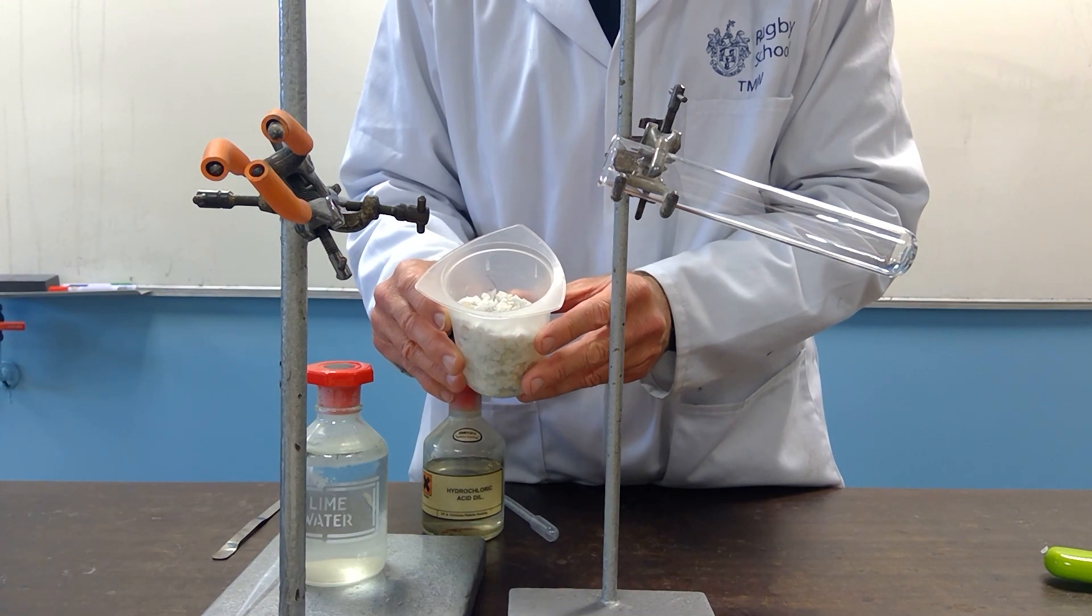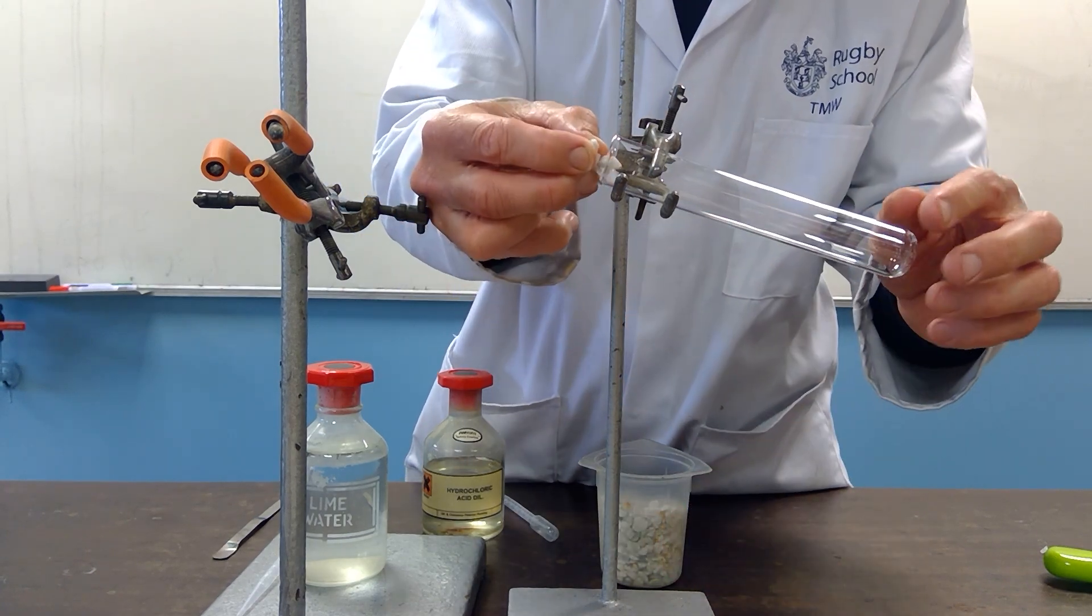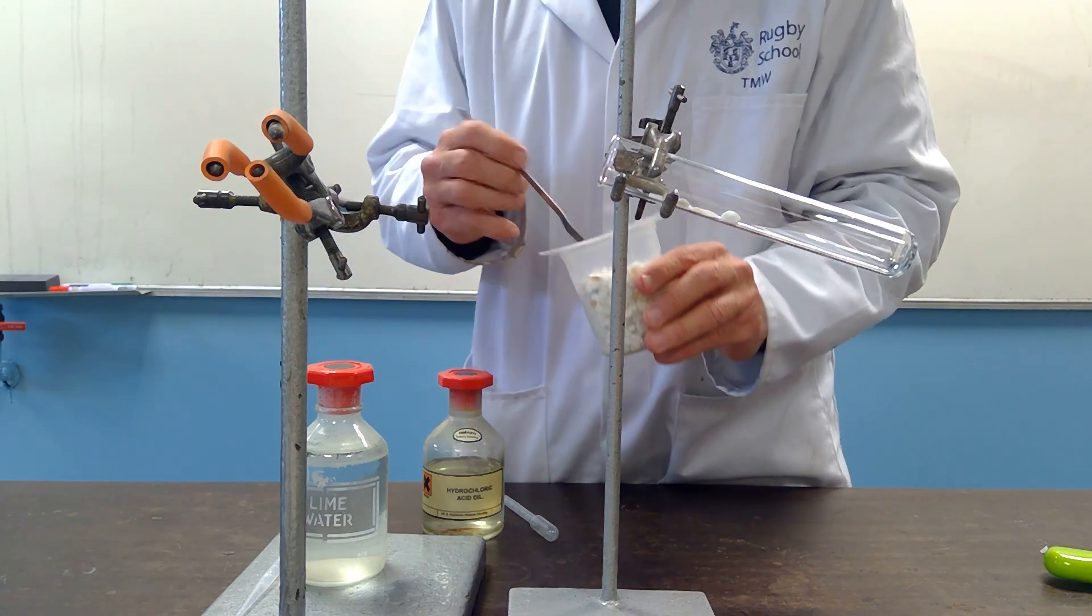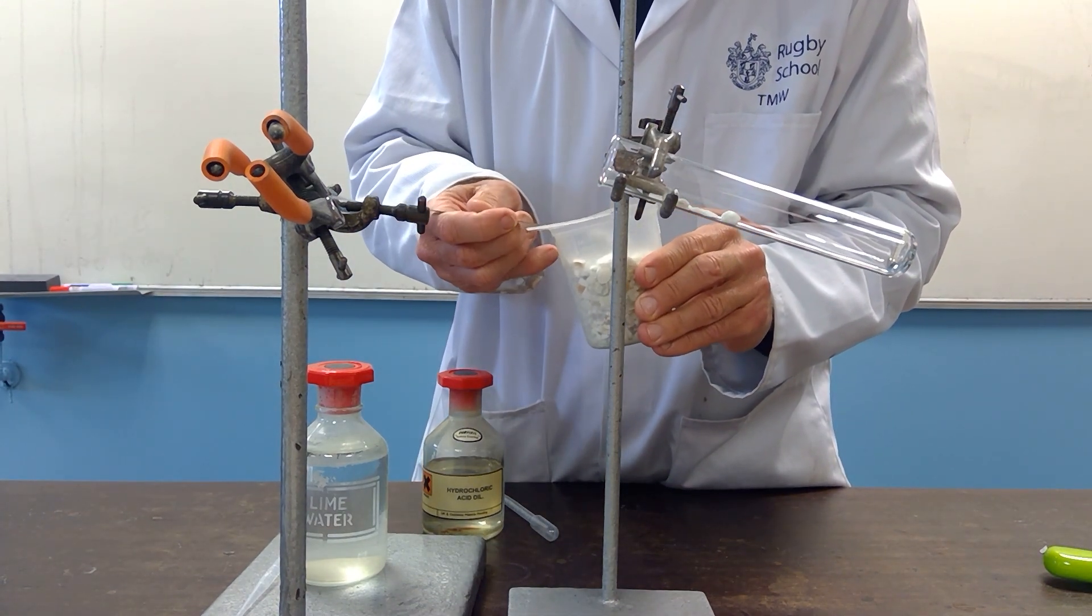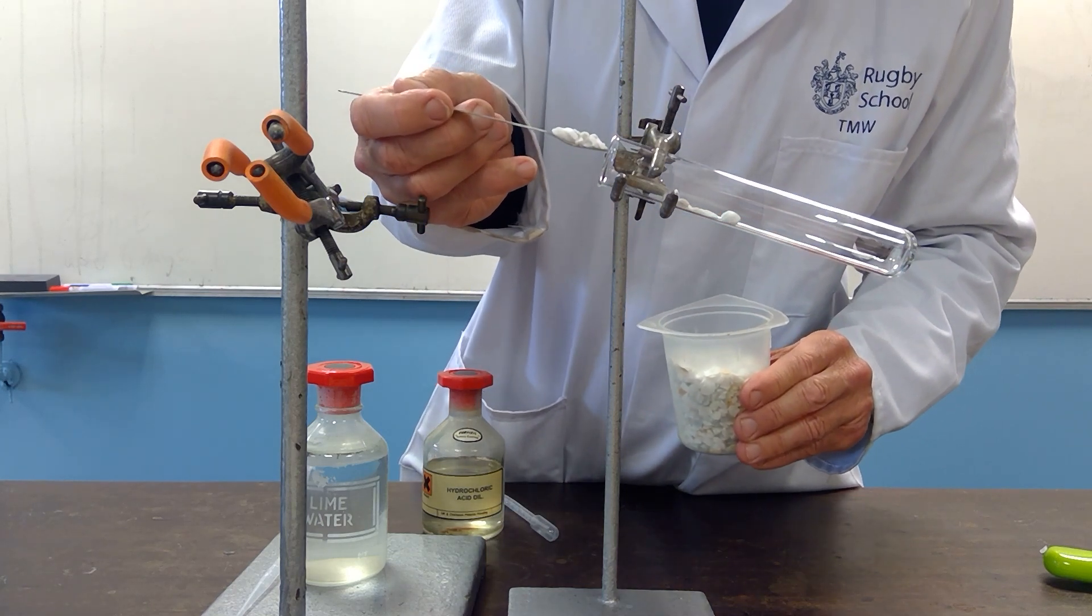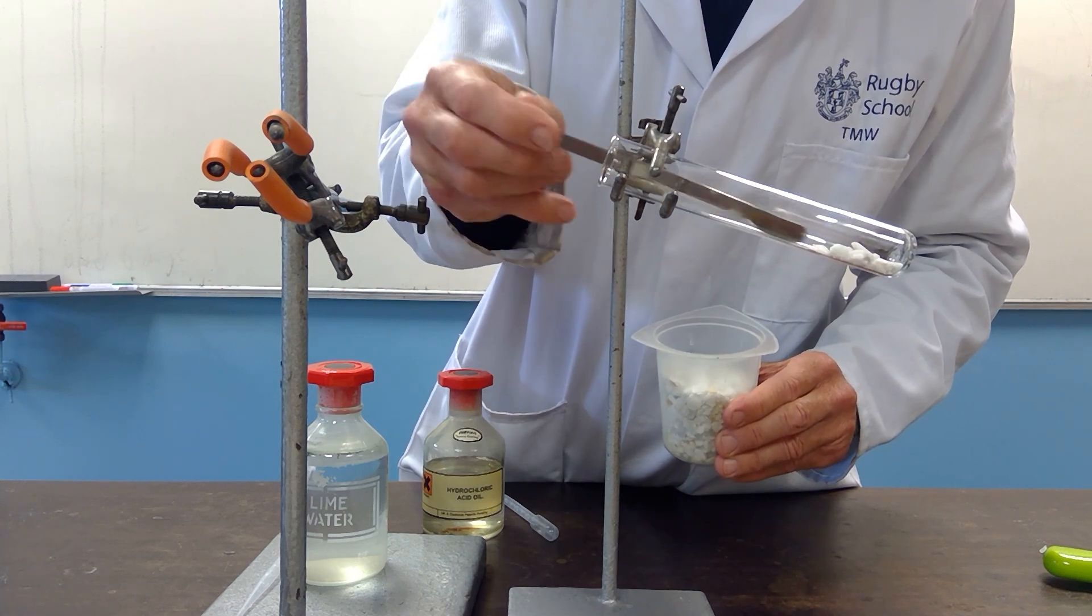So this time not copper carbonate, but we're going to use calcium carbonate. This time we do not need to heat. I'll just put a few bits of the calcium carbonate into the boiling tube. That will be plenty of excess.